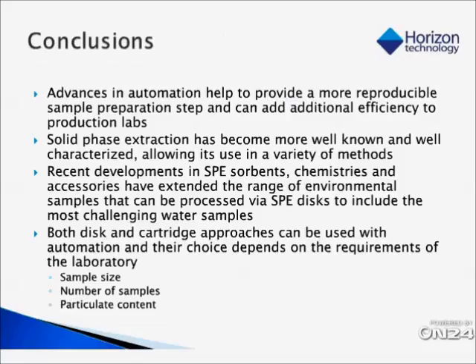So to conclude, advances in automation can help to provide a more reproducible sample preparation step and can add efficiency to production laboratories. Solid phase extraction has become more well-known and well-characterized, allowing its use in a variety of methods. Recent developments in solid phase adsorption sorbents, chemistries, and accessories have extended the range of environmental samples that can be processed via SPE discs and can include the most challenging water samples.